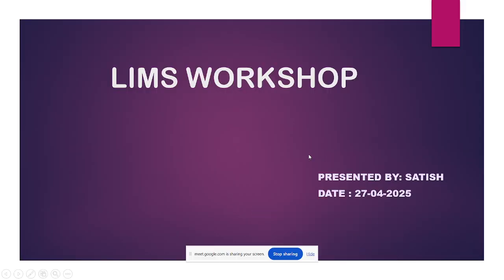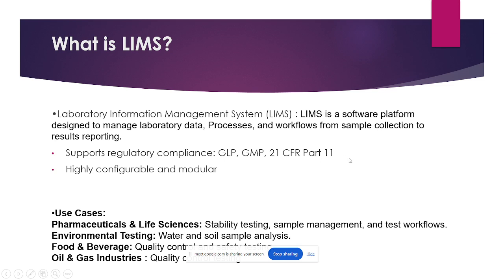Good morning. Basically, this LIMS application will be useful in pharmaceutical labs, clinical labs, and some diagnostic centers. Also, they use different LIMS applications. In the market, there are 100-plus LIMS applications available right now. Each environment will use different applications, based upon the business requirements.